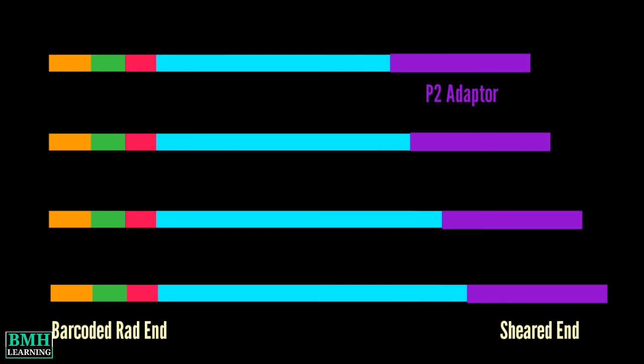Depending on the end goal, either single-end or paired-end sequencing can be used to generate the appropriate amount of information. Sequenced data is then analyzed to identify and score genetic variations in the samples or population of interest.